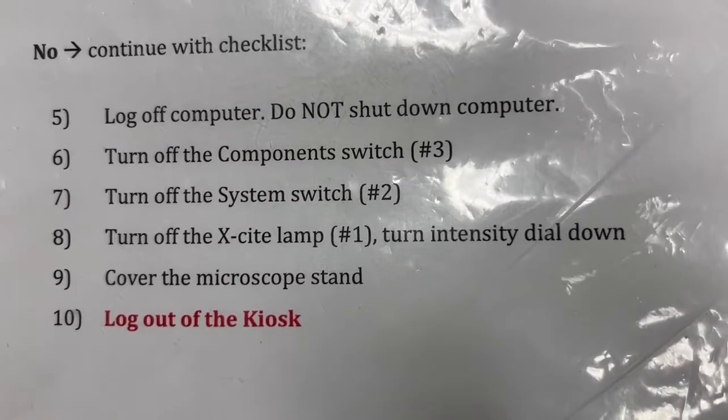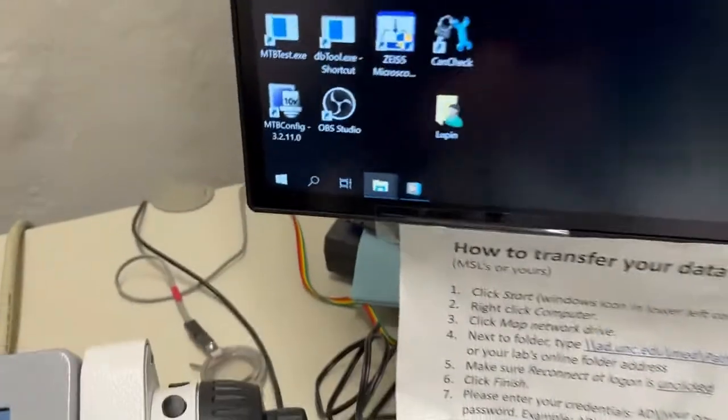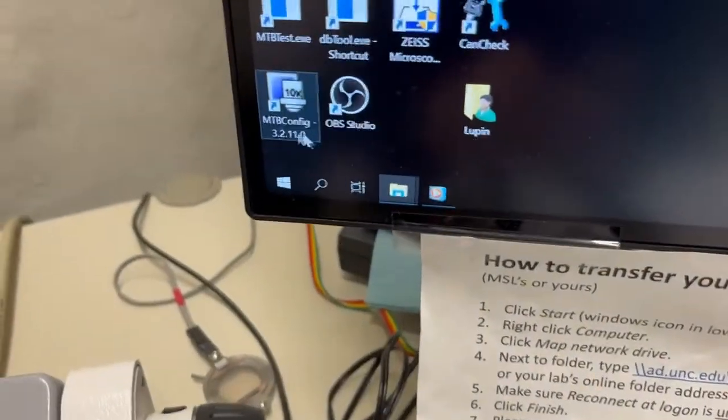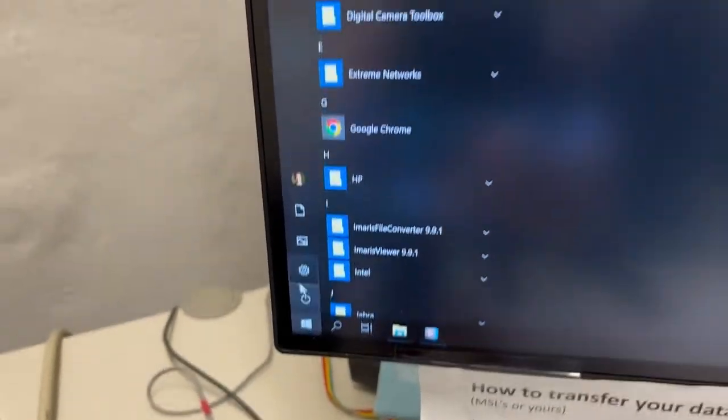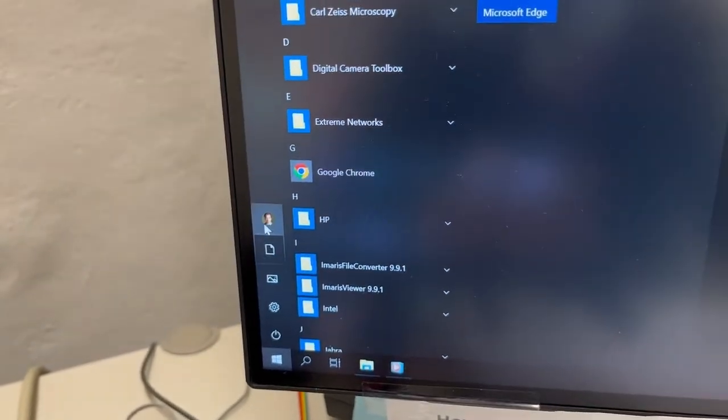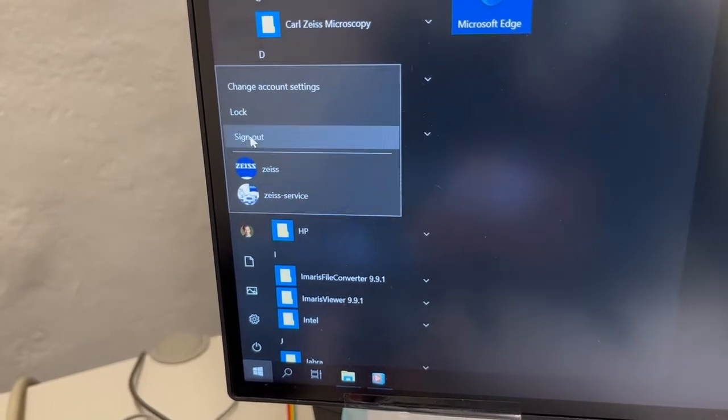So first you log off the computer. You do not shut it down. So to log off the computer you go click here on this windows icon. You click on Lupin's face and say sign out.